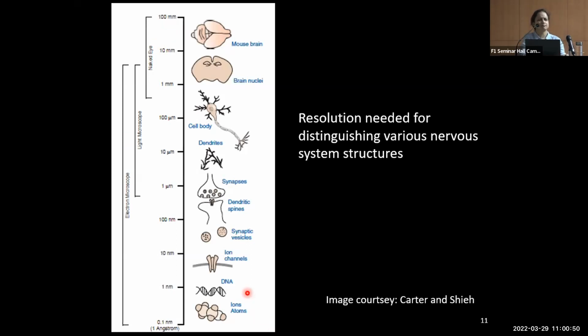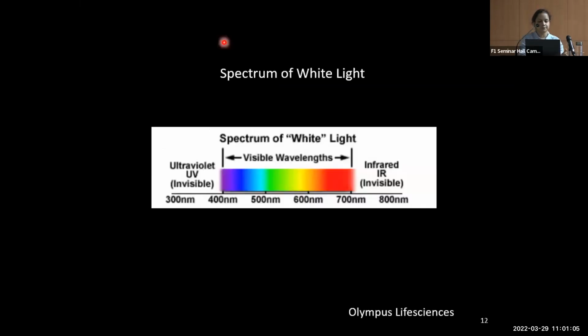Just yes, no? No, right? Okay. But with the 10x lens, will you see a mouse brain? Should be, right? Yes. So that is how you decide what microscope to use.